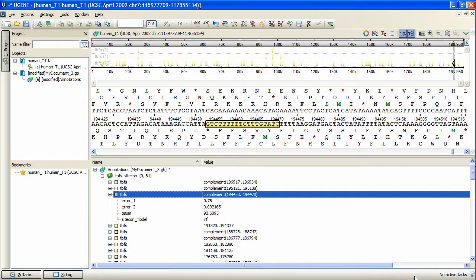The profile is built and saved, and can be selected as a profile for a TBFS search. That's how you can search for TBFS with SITECON in UGENE, and create specific TBFS profiles.